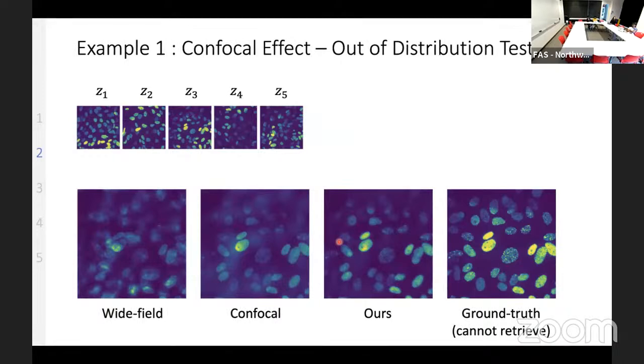The only other thing I can think of is the interference playing some role. You can probably generate destructive interference for the background, because people usually use confocal for incoherent imaging, where interference does not play a role. But here we are modeling a coherent setup, so interference might also play a role. Yeah, I think that is worth thinking about.